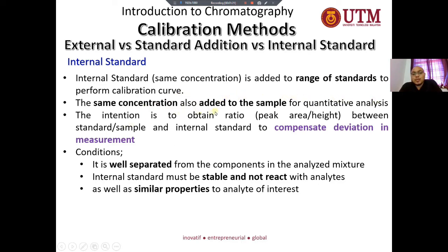The intention is to obtain the ratio of peak area or height between the standard or sample and the internal standard, to compensate for deviation in measurement.